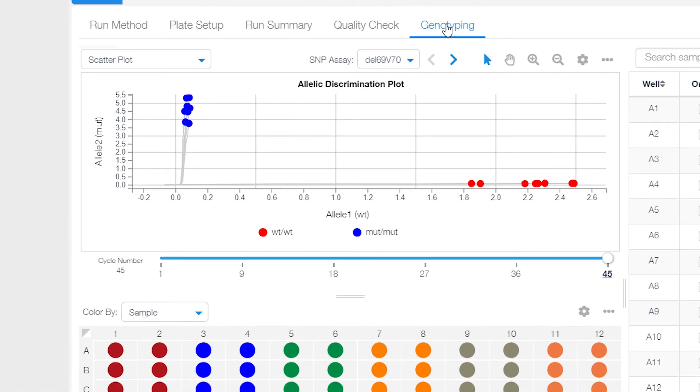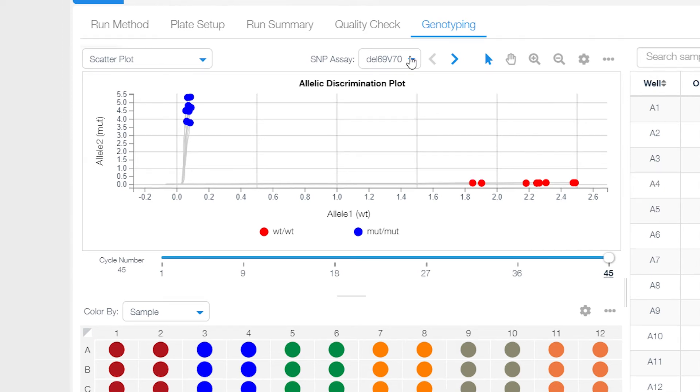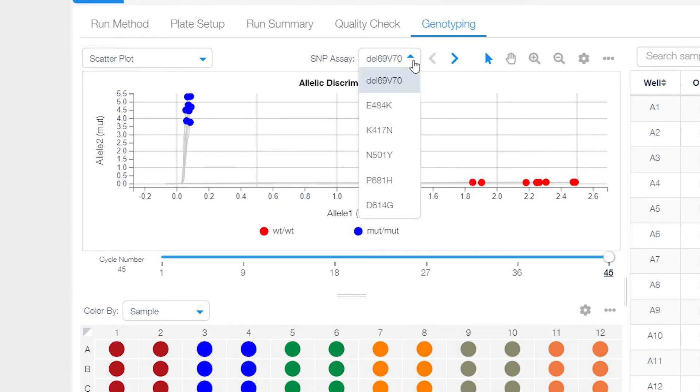If you ran more than one assay, select your mutation of interest using the drop-down menu next to SNP Assay. In this example, we will choose the N501Y mutation.